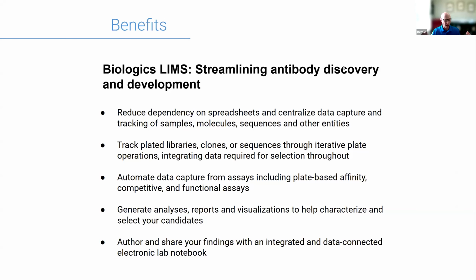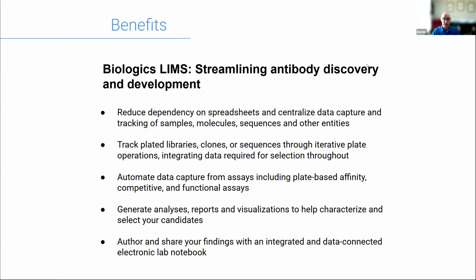when you have a comprehensive data management solution like we offer, you significantly reduce your dependency upon spreadsheets, which reduces errors. It reduces the time that is required for you to track and report on your various operations.